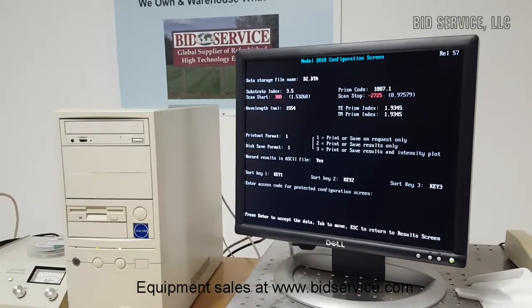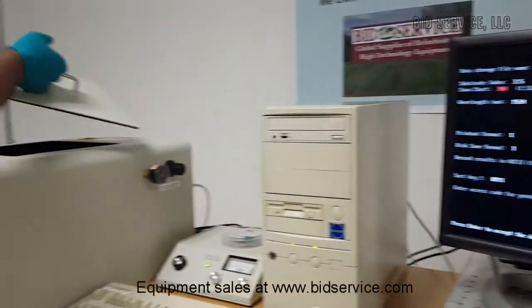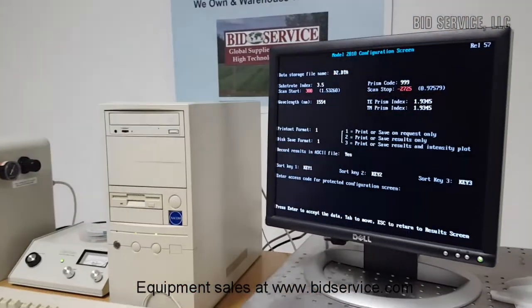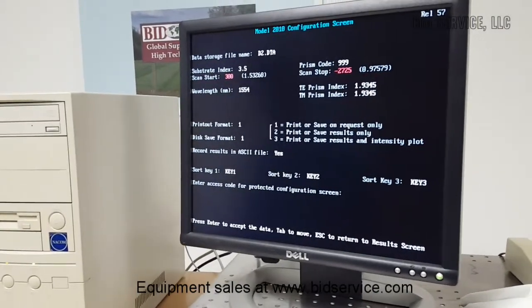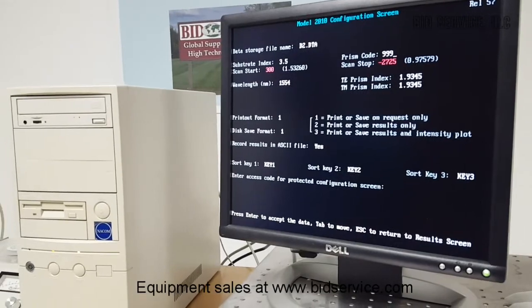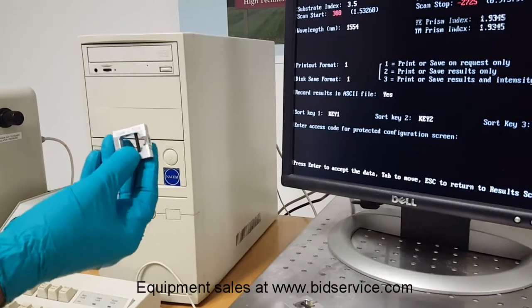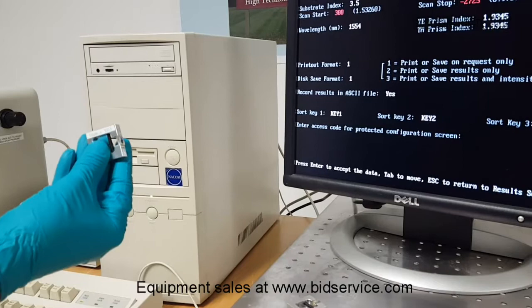The Prism code is here. Usually the Prism code is written on the Prism. If there is a Prism like this, the code will be written on the top, and the Prism can be inverted, and there will be a second code to be entered.